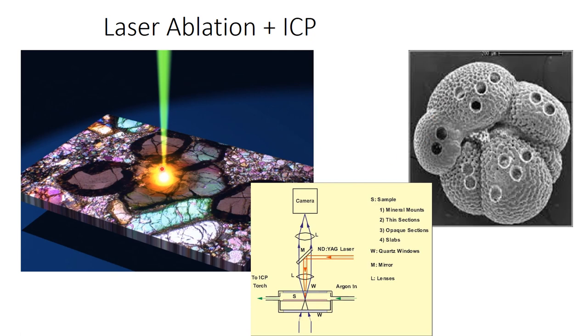And actually what happens is you form a very small plasma, and that causes the sample basically to evaporate and form a very, very high temperature gas of your sample. And then almost instantaneously, just above the sample, that gas will condense out into basically some dust of your sample. So some very, very small aerosol particles. And that happens in a small chamber underneath your laser, and then you basically blow that aerosol along a tube and into the plasma proper, and then that re-ionizes that sample so it can go into the mass spectrometer.